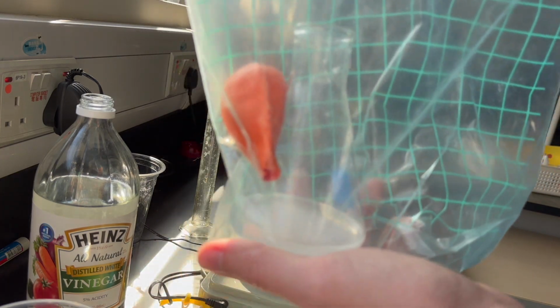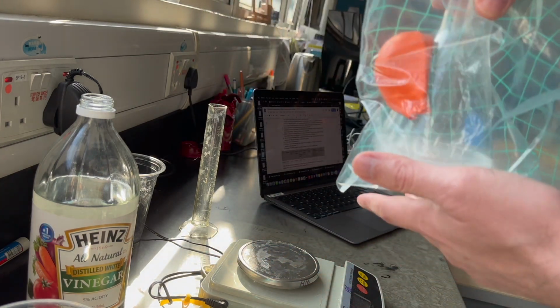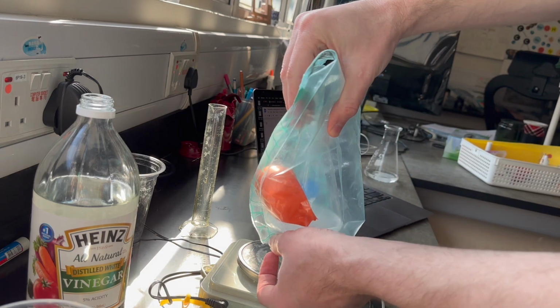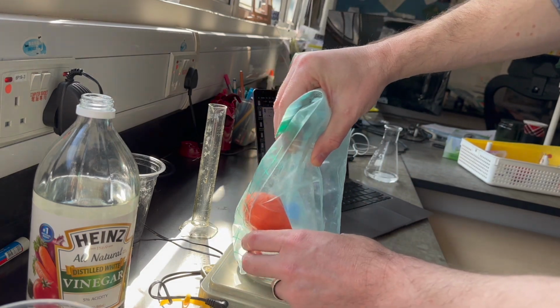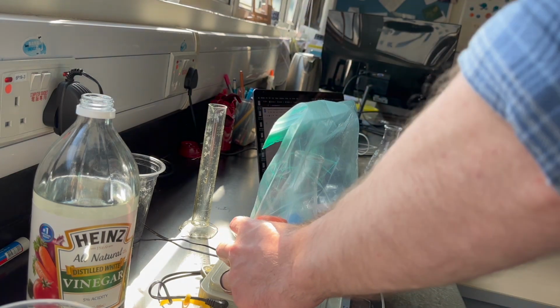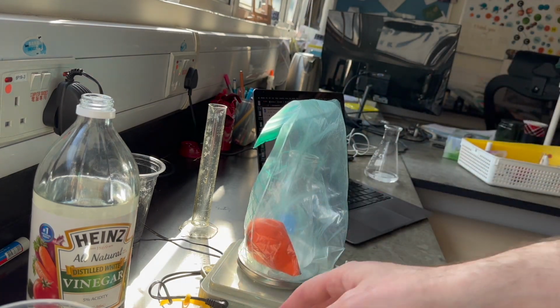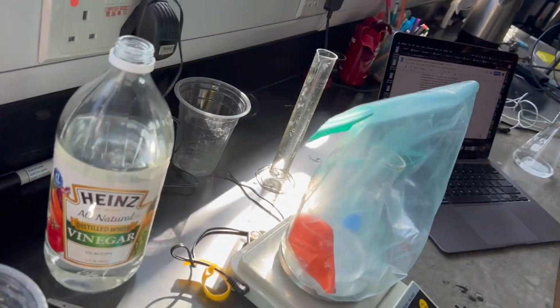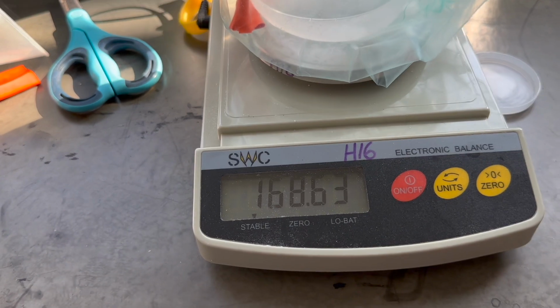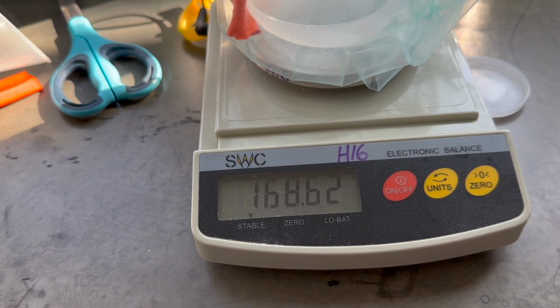Okay, looks like it's winding down, so I'm going to put this on the scale, being careful that none of the sides of the bag touch the desk or anything around the desk or even the bottom part of the scale. All right, and let's watch the scale, make sure. Okay, that's good that the mass is not decreasing. That means no gases are escaping.